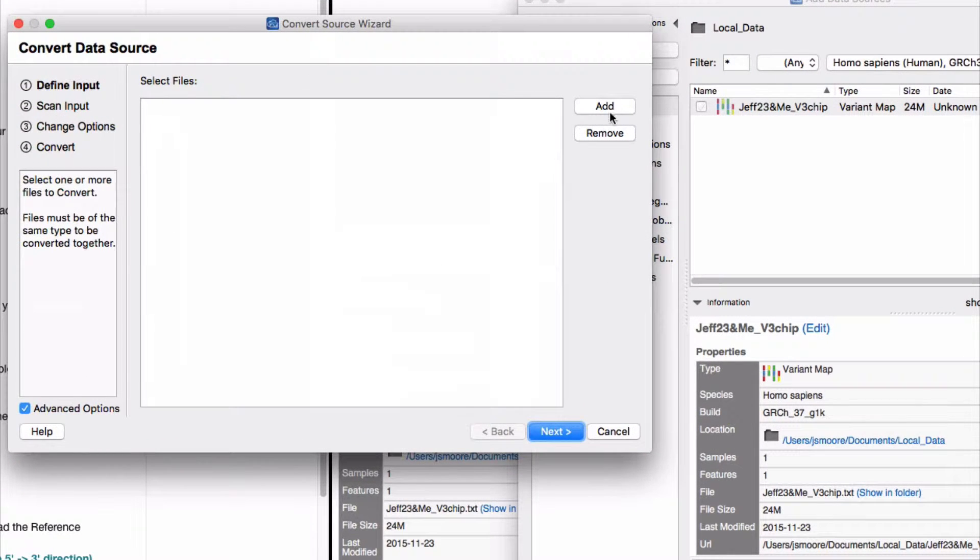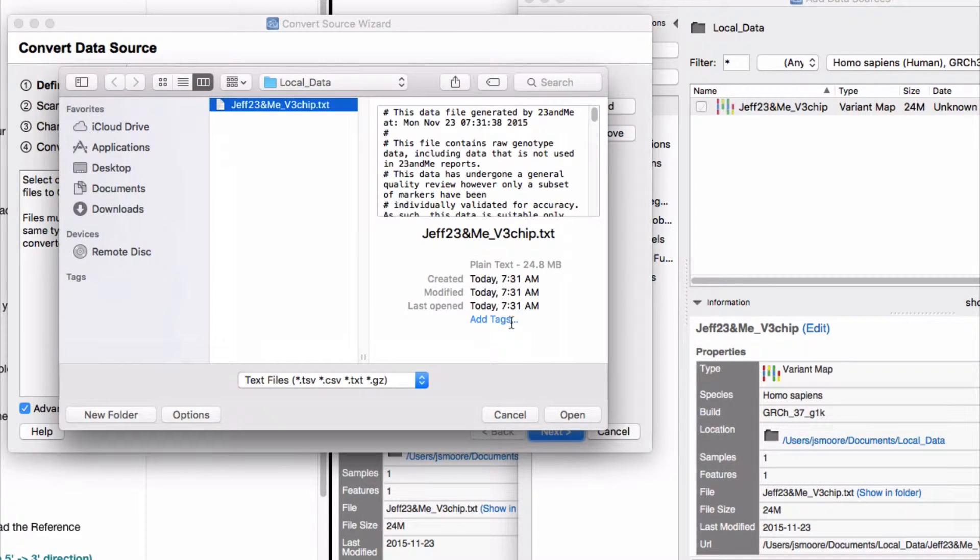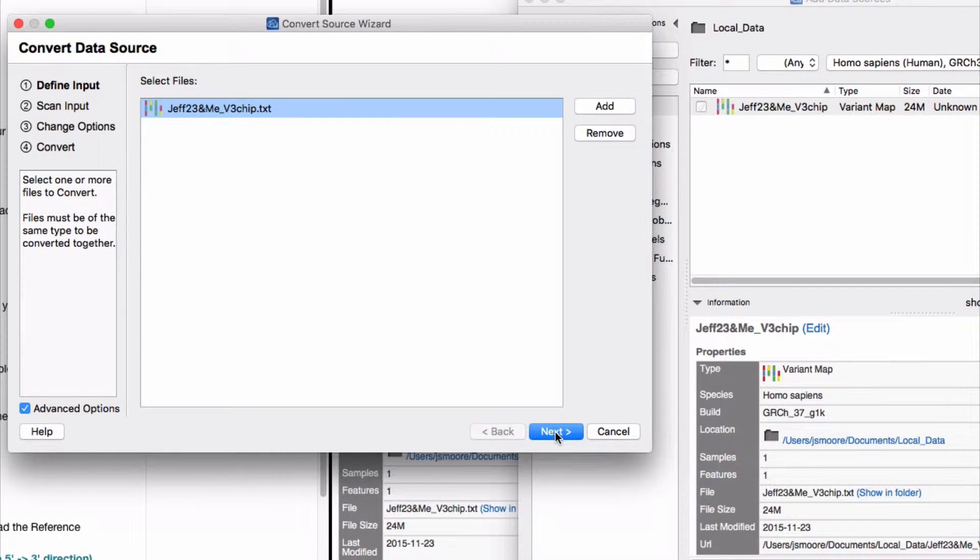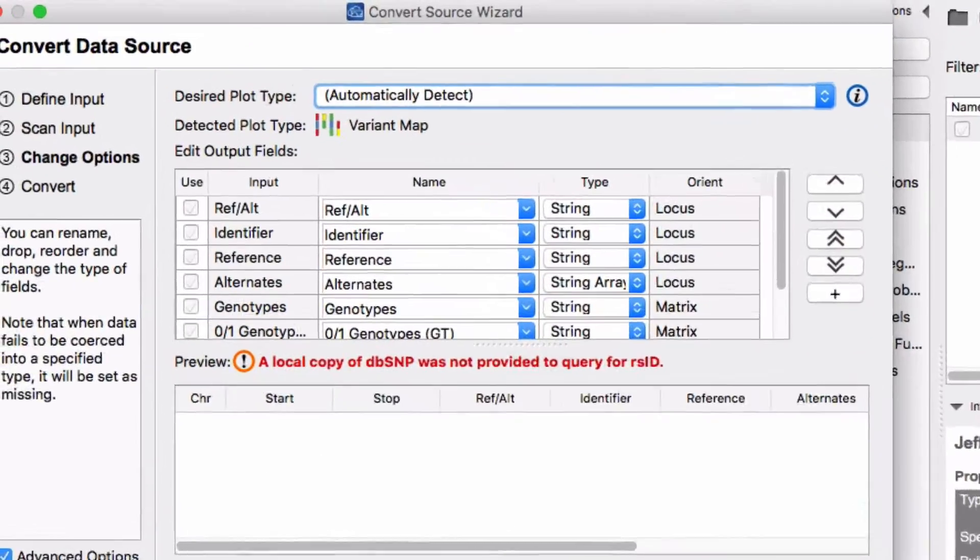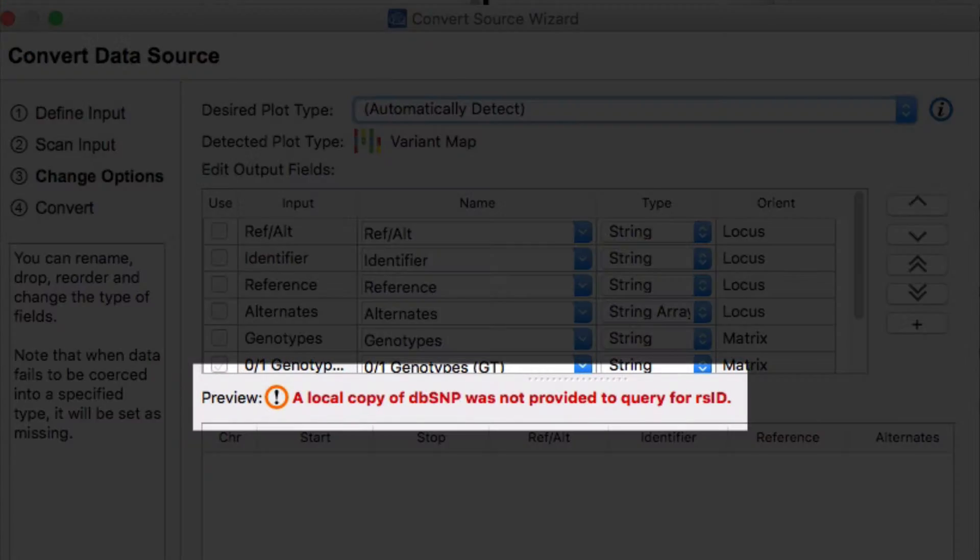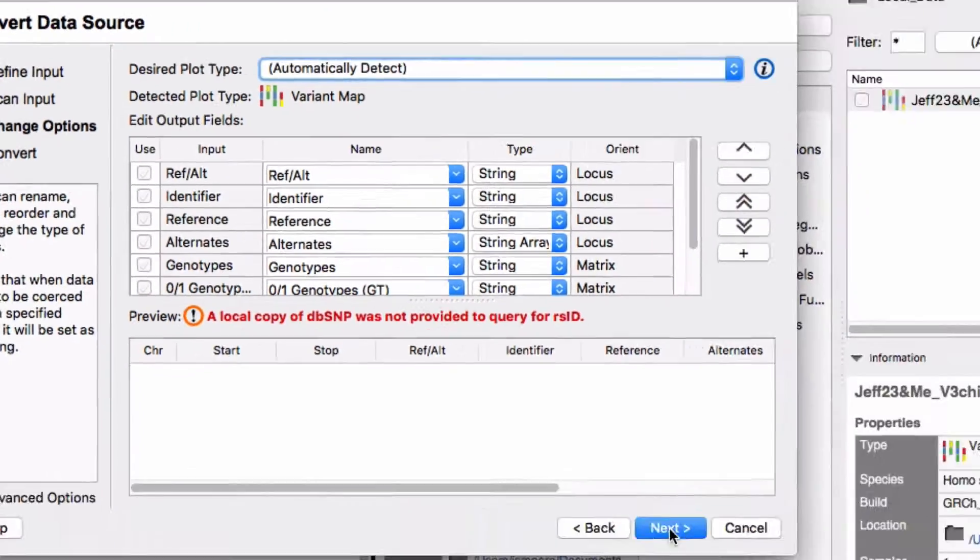Now add the raw data file into the convert source wizard. Highlight the file name and click next. We need to download a copy of DBSNP to complete the conversion.